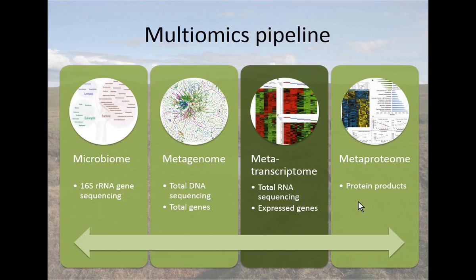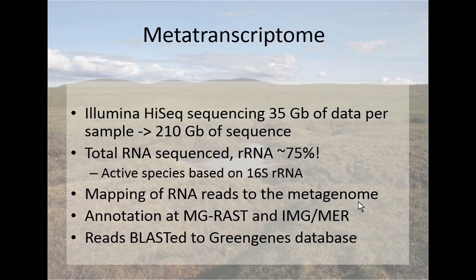But that was just the DNA, and I saw that there was not that much difference among the samples. So then I wanted to do the metatranscriptome, so sequence the total RNA from these sites to understand what kind of genes the species in my sample are expressing at the sampling point. That was done also with Illumina HiSeq, and I sequenced the total RNA. So often when people are doing metatranscriptomics, they remove the rRNA fraction by different depletion techniques.